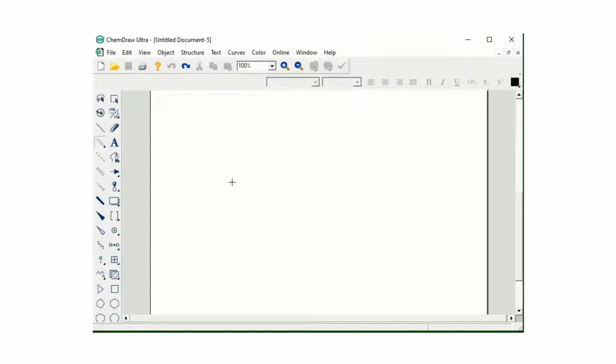In this video, we are going to talk about ChemDraw and also drawing organic compounds. We will also convert that particular organic compound to a name and also predict the carbon NMR and the hydrogen NMR. So this is ChemDraw after installation, and it's ready to be used.